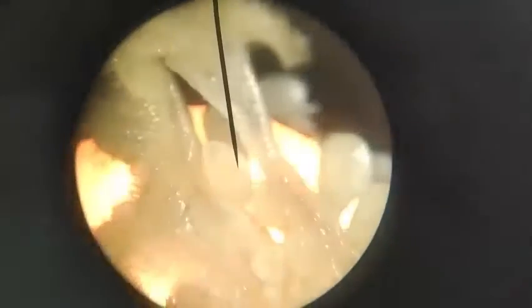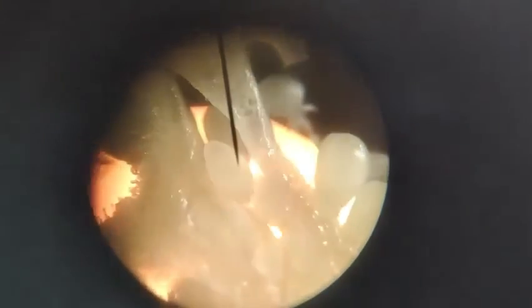I cut the ovary open, a very small, thin sample of it. Look at the ovules, they are like fish eggs inside it. Aren't they beautiful? So I try to, again, lower the light intensity. It's not easy to fix the camera on one point. Now, they are so beautiful. Look at the ovules.